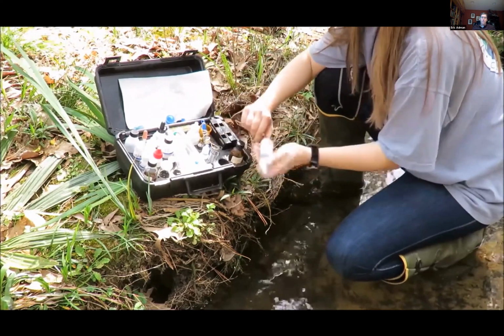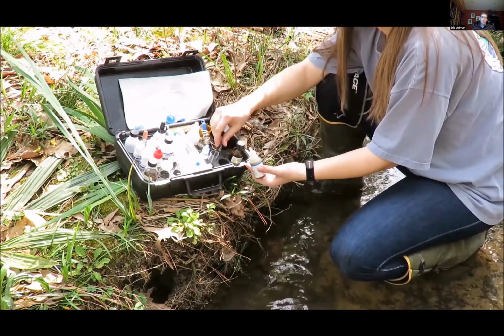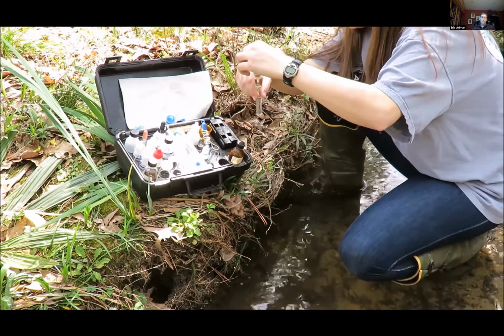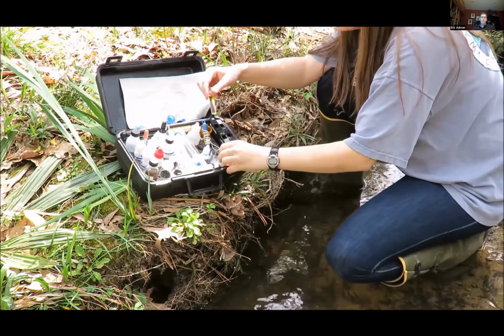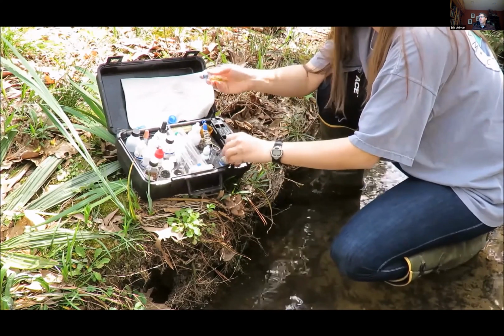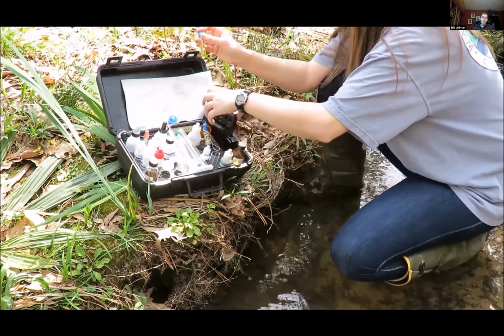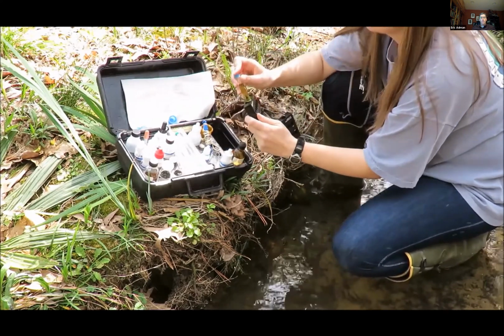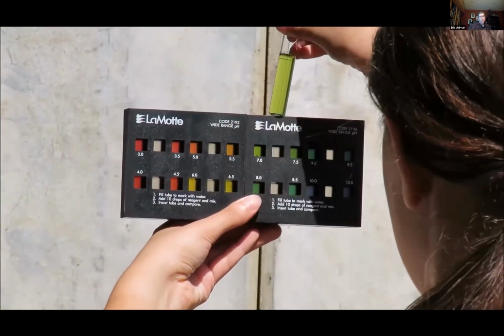Locate the wide range indicator bottle in your kit. Add 10 drops to your sample. When dispensing the reagent, take care to hold the dropper bottle vertically. This ensures uniform size drops. Tap the tube and invert 2 to 3 times to mix. The color will be pastel or pale. Insert the tube into the color comparator and match the sample to a color. It is helpful to hold the color comparator up to a well-lit uniform background like a clear patch of sky. Record the pH to the nearest half unit.